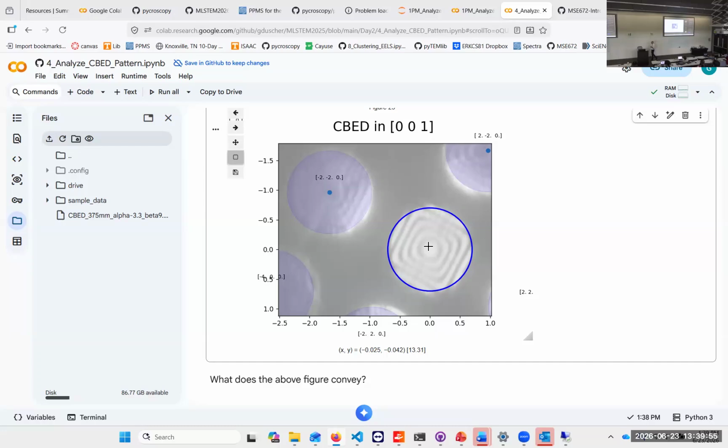If you want to do that with the line scans, it's often easier to go through the center and measure from one end of the disk to the other, the one you can find easily. So from the center to the rim is always the same distance, right? We have circular disks, hopefully. And so different ways of calibrating these diffraction patterns.